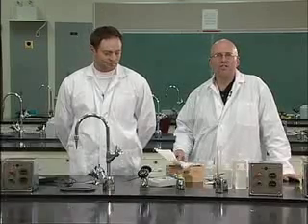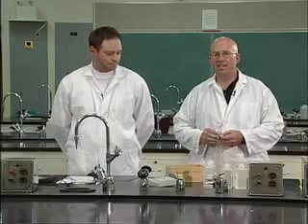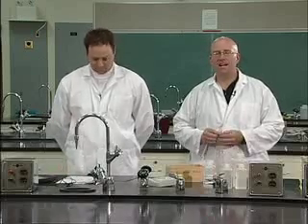Today we're starting with the first one, the determination of mass, volume, and density of both solids and liquids, right? Exactly. All right. So the first thing that we want to do, density, as we've talked about in class, is a physical property of matter that is often very useful to us. So what we want to do is figure out how to get the density of any kind of solid.